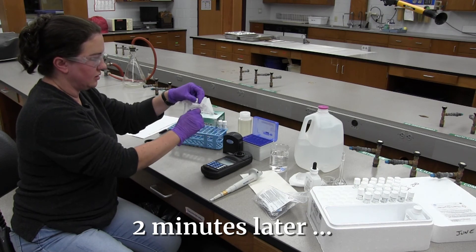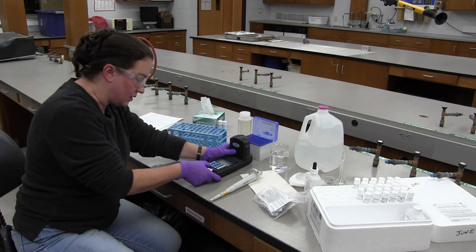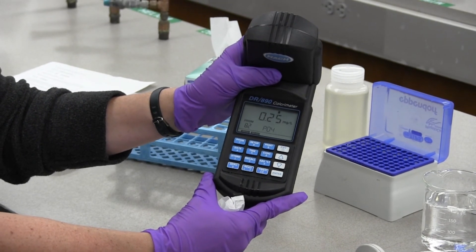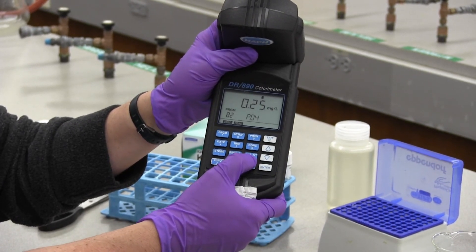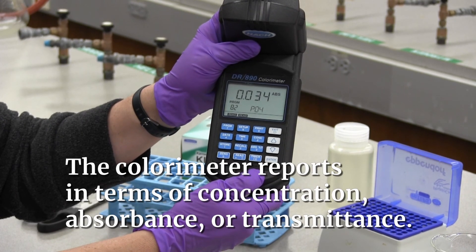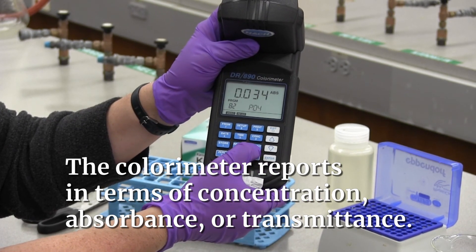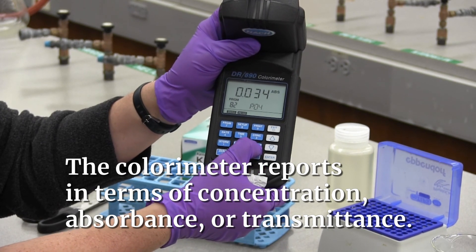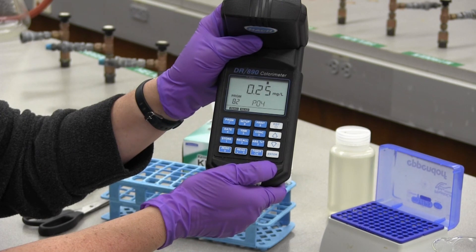Now we're ready to read our sample. Make sure you wipe the vial, then press read to get the reading. It's 0.25 milligrams per liter for the sample. We can also see what the absorbance is — there's a key on the meter that says absorbance or percent transmittance. Press that key to see the absorbance: it's 0.034, and that relates to the concentration in milligrams per liter. You can also press that toggle key again to see the percent transmittance — it just goes back and forth. To get back to concentration, press the concentration key and it returns to milligrams per liter.